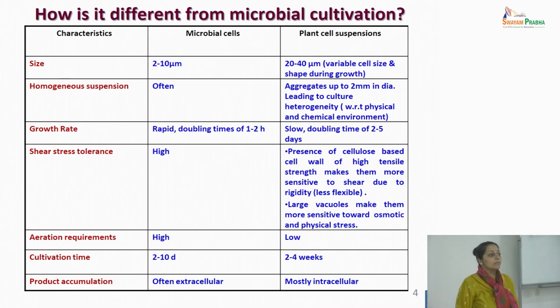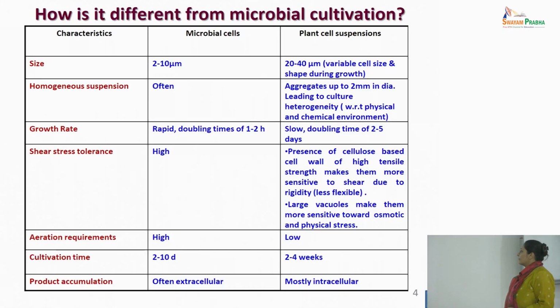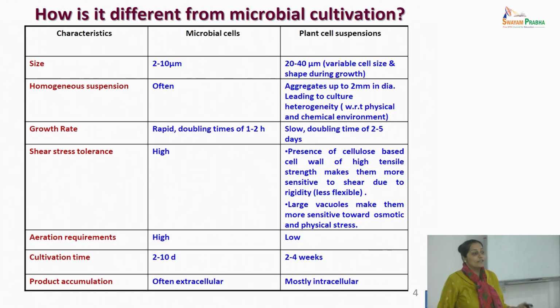If it becomes a large production scale reactor like 200,000 liters, with a very high aspect ratio and a photobioreactor, everything will become a challenge. So make note of the long drawn fermentations, the sterility requirements, the making of the reactor, the cleaning of the reactor, how you will harvest the biomass, and how you will clean and re-sterilize it.